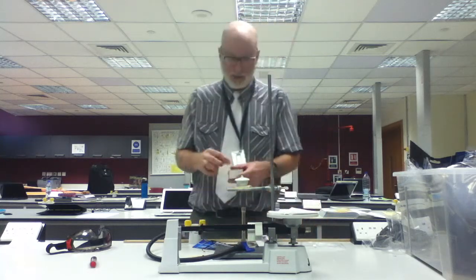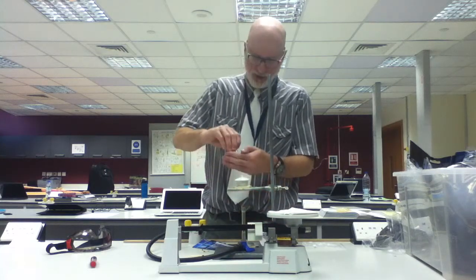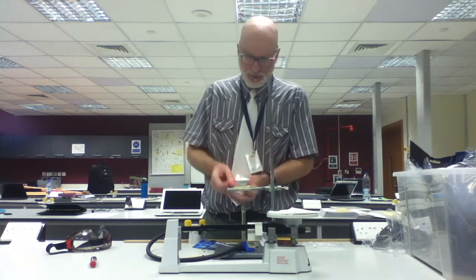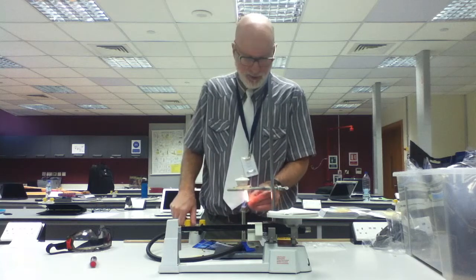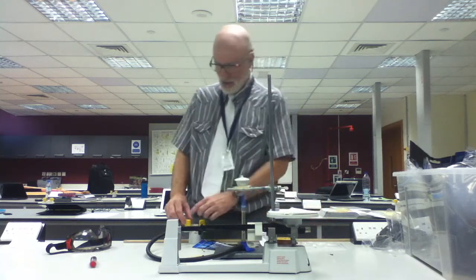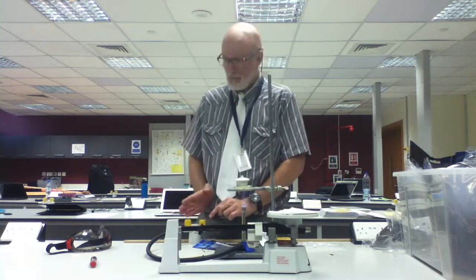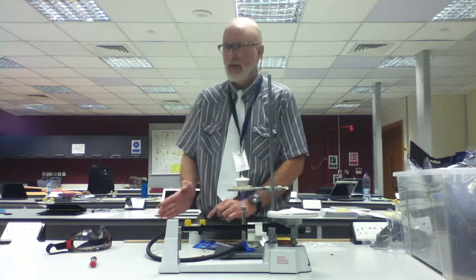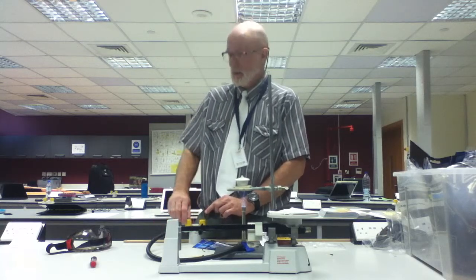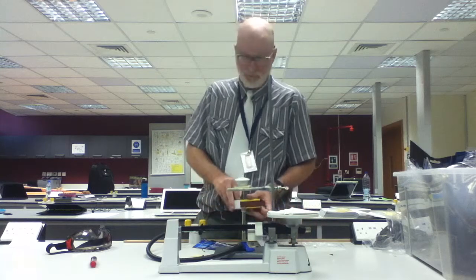You take your match and light your Bunsen burner. Turn it on all the way. When these two wings are parallel with the flow of gas, that's on. When they're perpendicular, it's off. You got it?